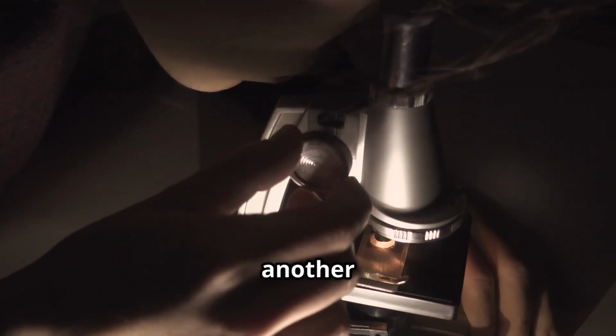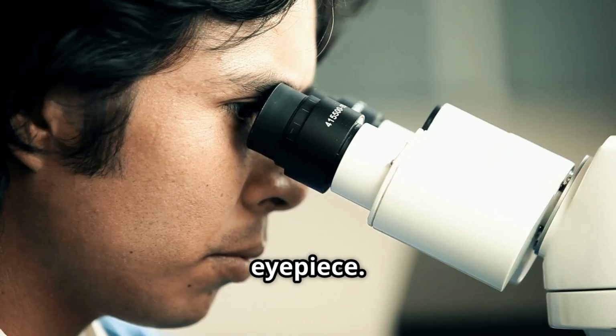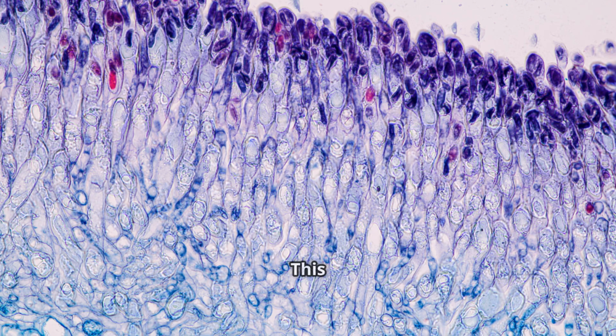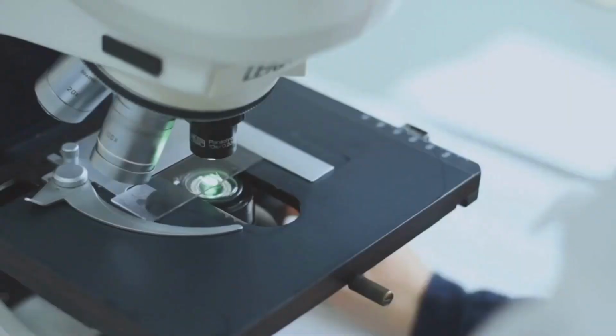Field of view is another key term to understand. The field of view refers to the visible area seen through the eyepiece. As magnification increases, the field of view decreases. This means you can see less of the object at higher magnifications, but with more detail.